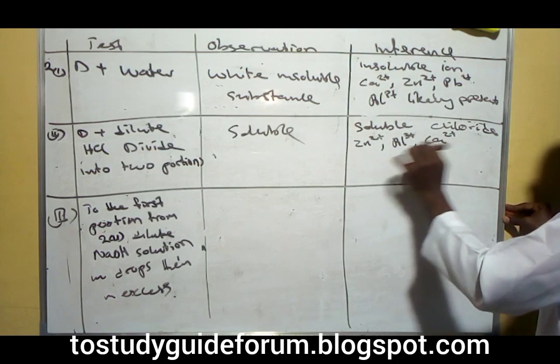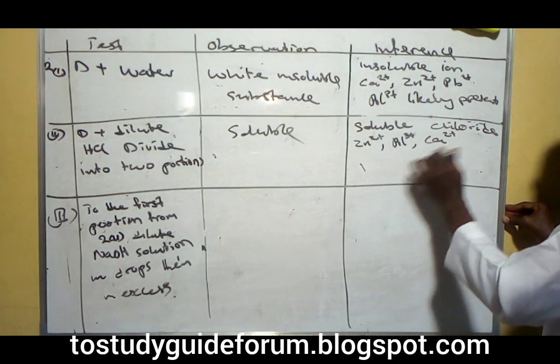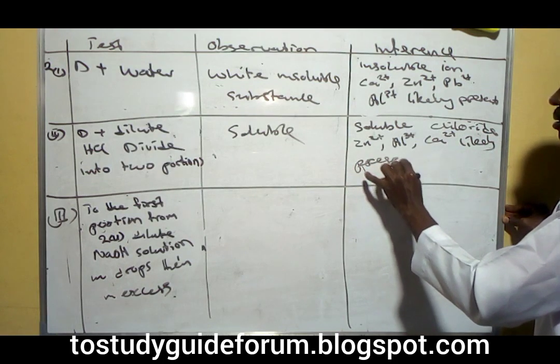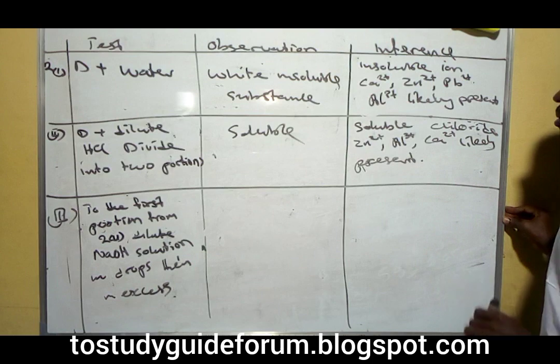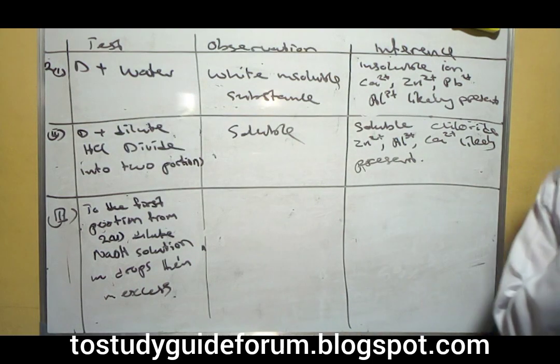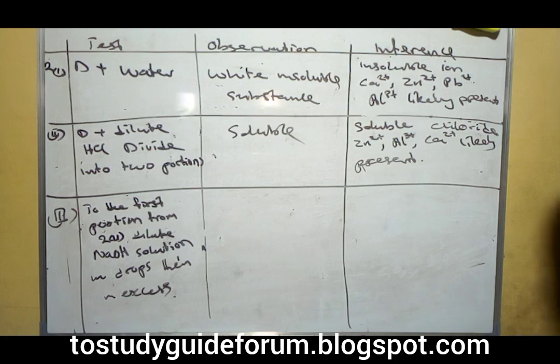That means lead is absent. These ones are likely present, while lead is no more there because the chloride of lead is not soluble.